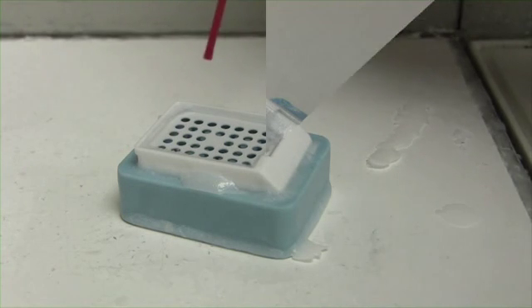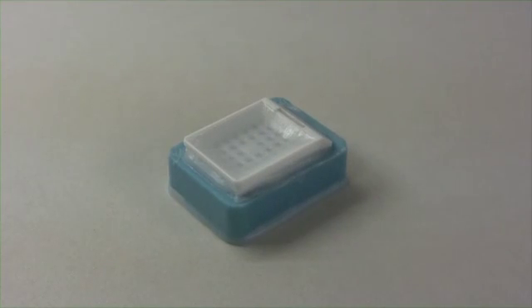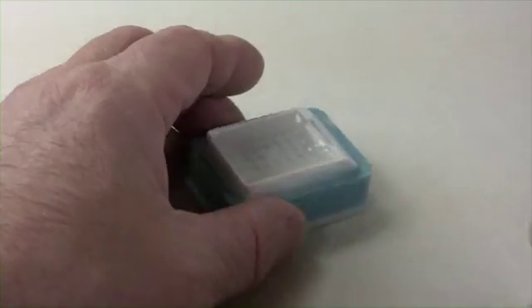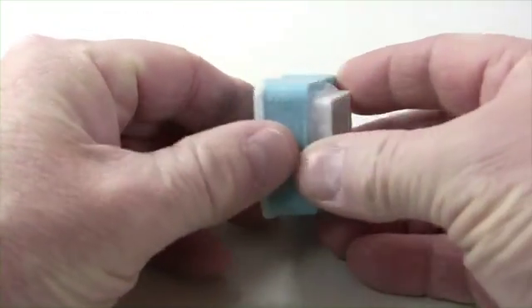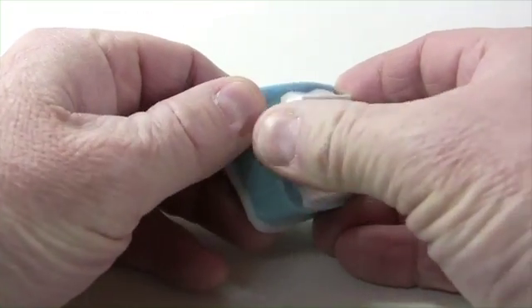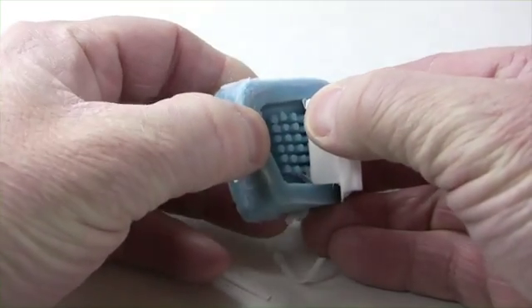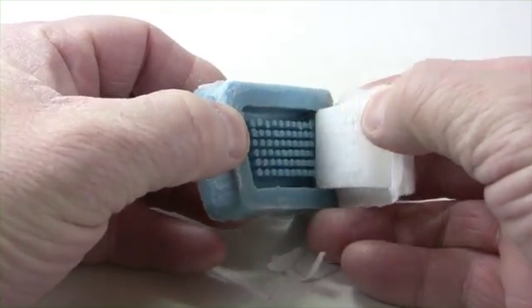Before I pull apart the array mold and the paraffin block, I like to wait till they are both at room temperature. The array mold will be softer and more flexible at room temperature and the cores will last longer. Pulling them apart when the rubber is stiff and cold could break some of the core rods out of the array mold.